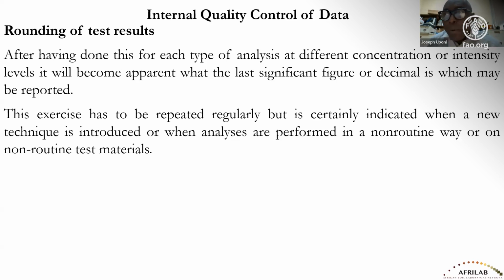Secondly, make sure that your equipment is properly calibrated and vouch that it is performing according to expected standard. Lastly, that the people who are performing the analysis are adequately trained to carry out the procedure, and that you maintain proper records, especially your quality control charts for all your control samples, so that you're able to know when analyses are out of order and then be able to take corrective measures to bring the analysis back in order.